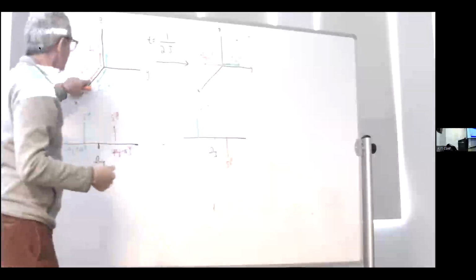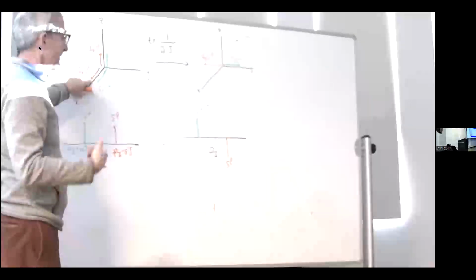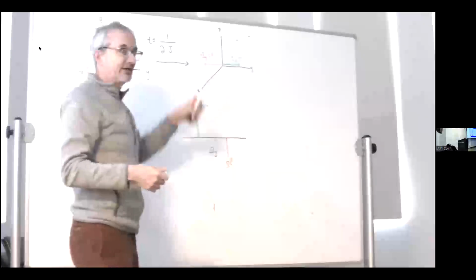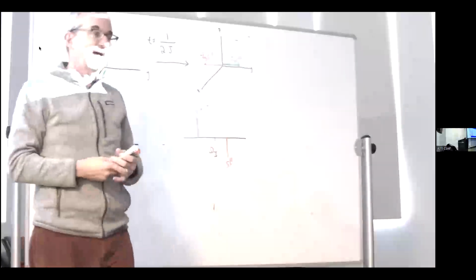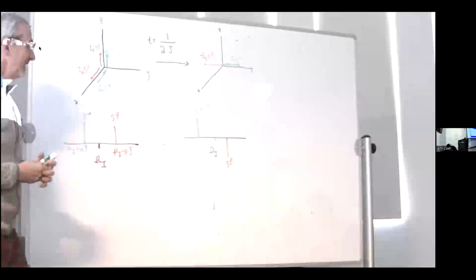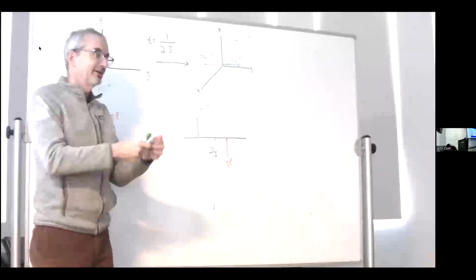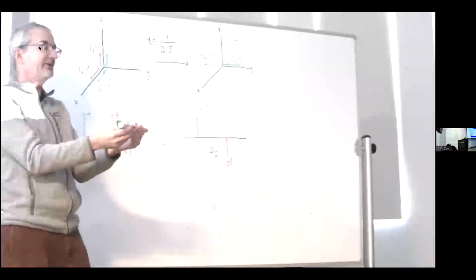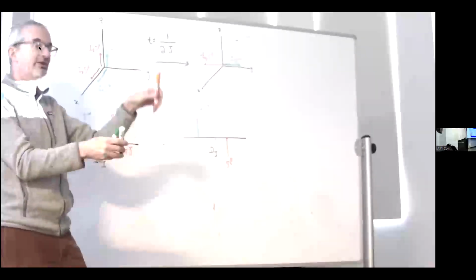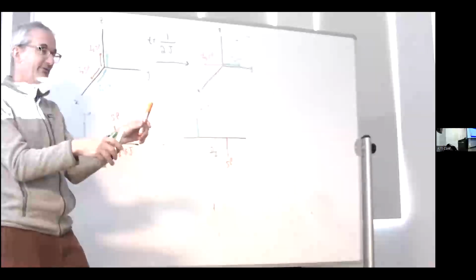Whereas the magnetization connected to the nitrogens that are beta rotates by minus 90 degrees and ends up on the minus y-axis. And at that point, if I turn on the receiver, this is what we talked about the other day, I'll see what we call an antiphase doublet. The two magnetizations are 180 degrees out of phase. And then one doublet component is positive and the other doublet component is negative.